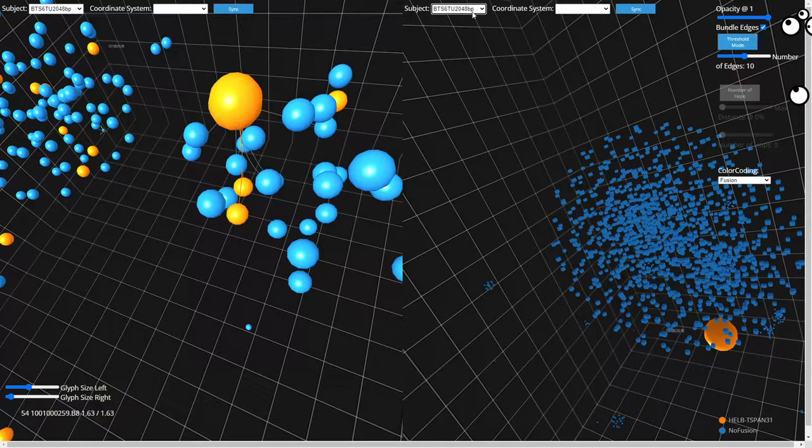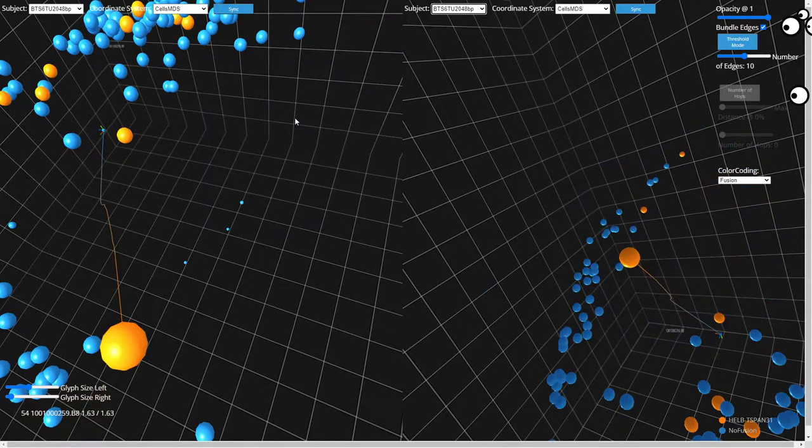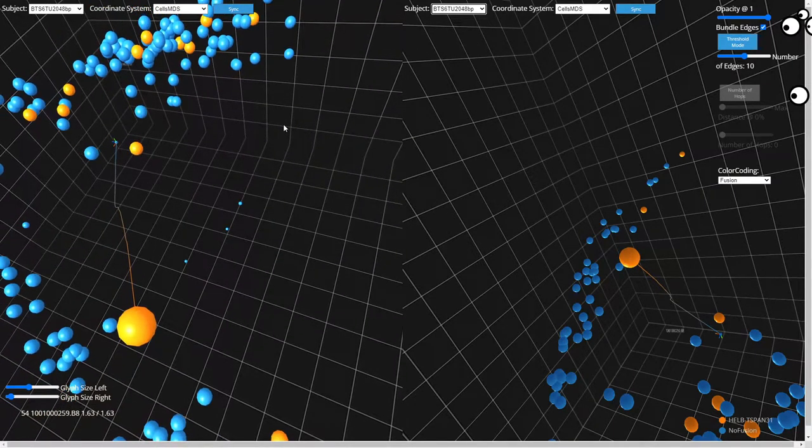BP stands for bipartite. BT stands for brain tumor. S6 stands for sample 6. T stands for tumor. There'd be a P there if it was a periphery. And U stands for unpanned. They have different cell types that they capture in the chemistry in the test tubes before doing the sequencing. So these were the ones that didn't get caught in any of those filters.